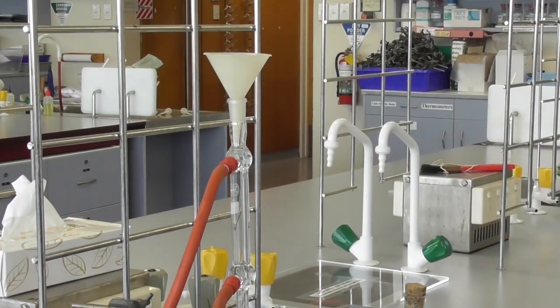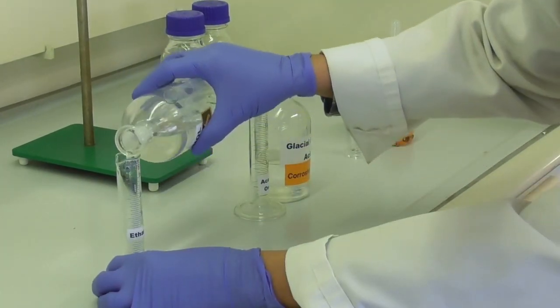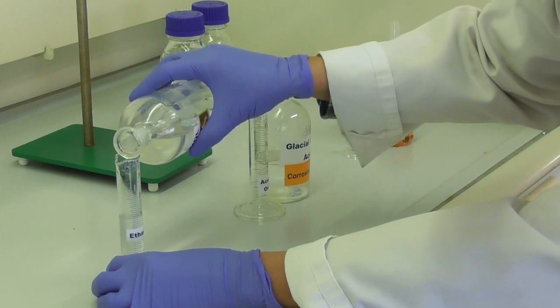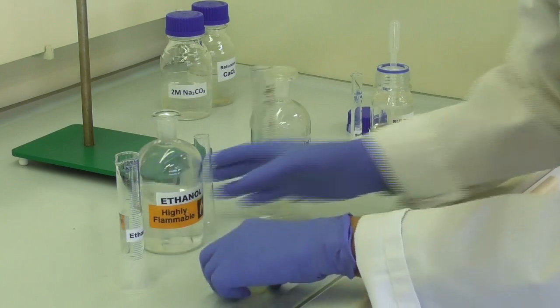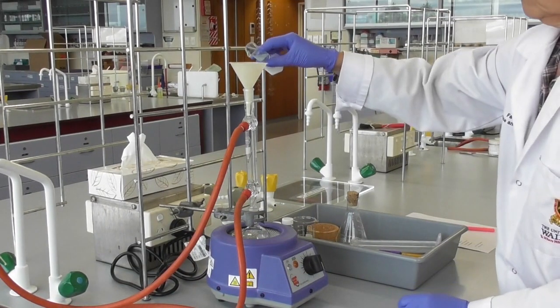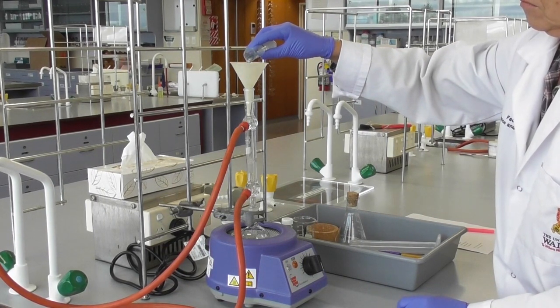Next, we add a funnel on top of the condenser. In the fume hood, we measure out the first reagent, which is 15ml of ethanol. We take this to the apparatus and add it through the condenser into the flask.